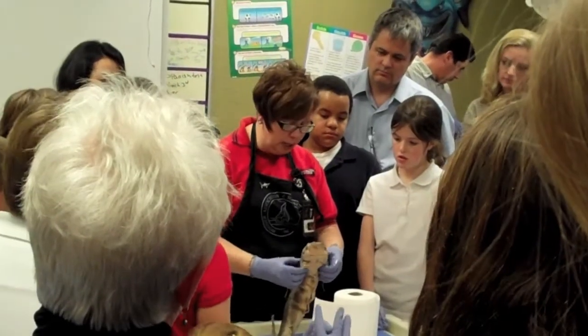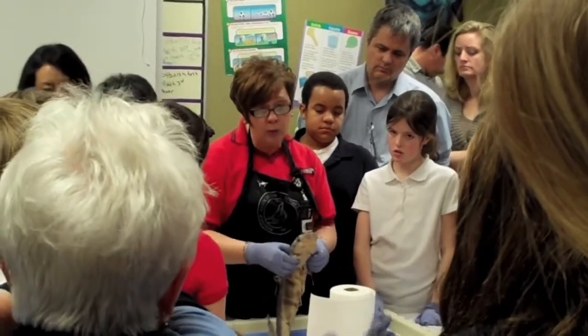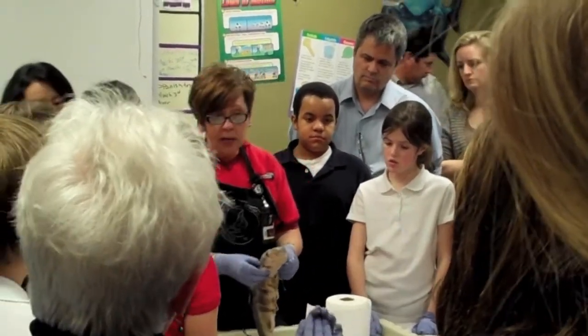Can I pick a shark up and feel right here? This is cartilage because this shark does not have bones. Bones would weigh you down too much.